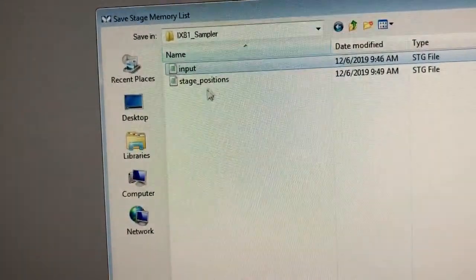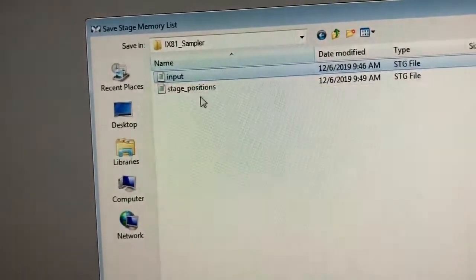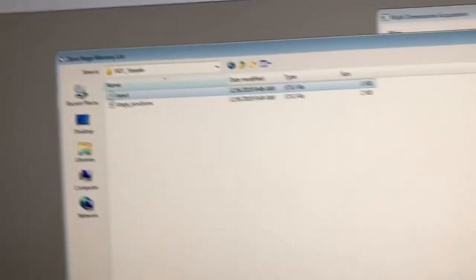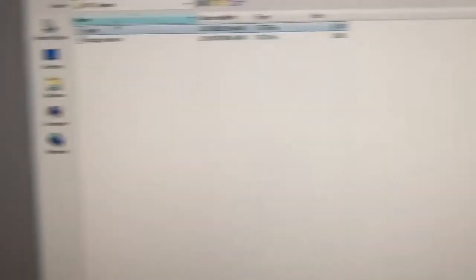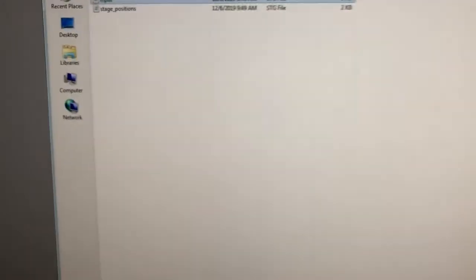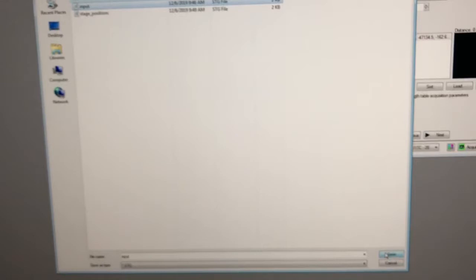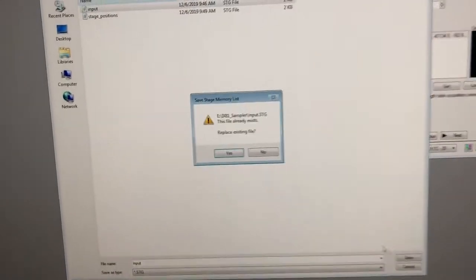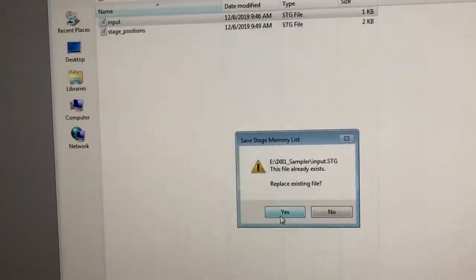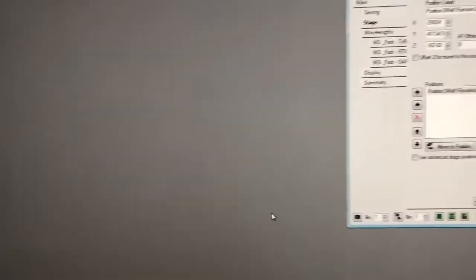So this folder will always have input and stage positions. We're going to save our center position and call it input. So we're going to save. It asked me if we want to overwrite it. That's fine. You can overwrite it.